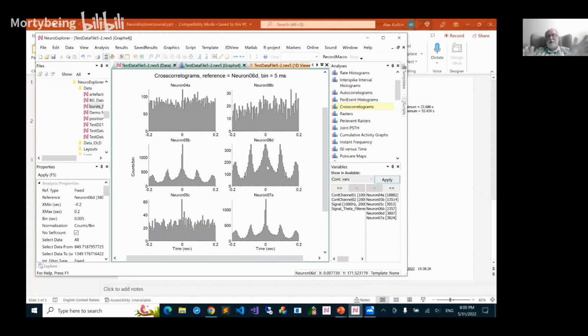Excuse me, answer the question. Alex, sorry, can I ask you a question? Yeah, sure. Here I look at this picture. Actually, I think that in negative time there's little actual data. But here you can draw a picture like minus 0.2.